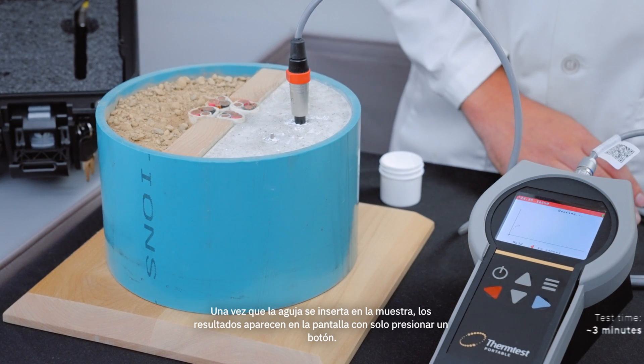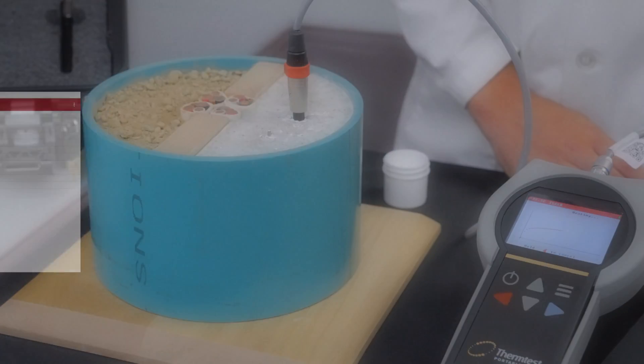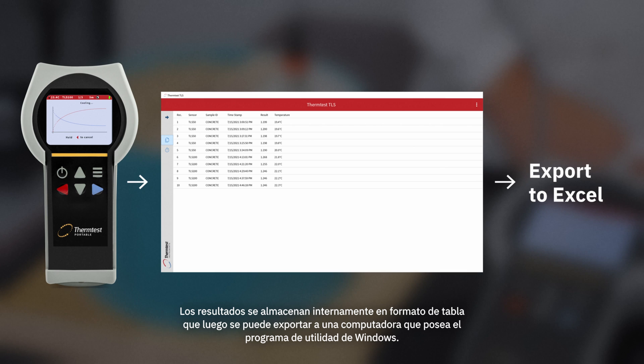Once the needle is inserted into the sample, results are displayed on screen with the push of a button. Results are stored internally in table format, which can then be exported to a computer with the included Windows Utility Program.